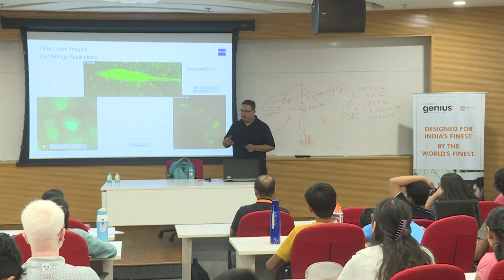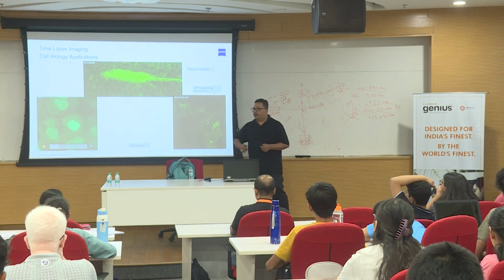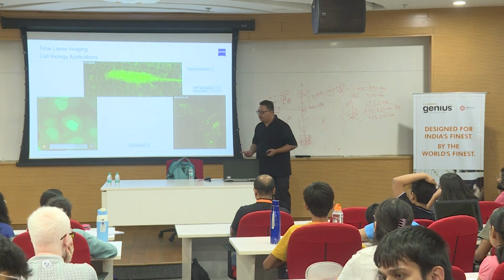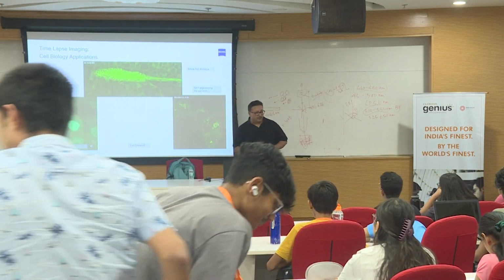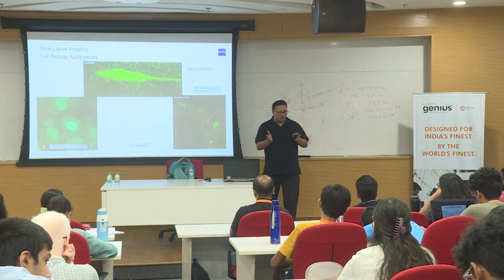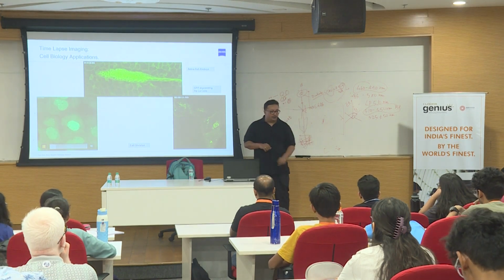From seconds to minutes to hours to days and even to milliseconds. And it all depends upon what type of functionality or what type of samples you are interested in imaging. Somebody will show quite abrupt changes. Somebody will show some transports really fast, some actions really fast that you would like to acquire. So how do you acquire this? You try to play a little bit with the confocal system, setting the adjustments in such a way that it can do fast imaging also.